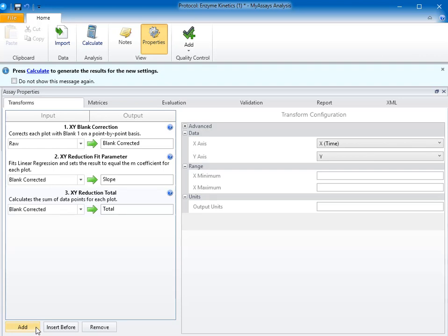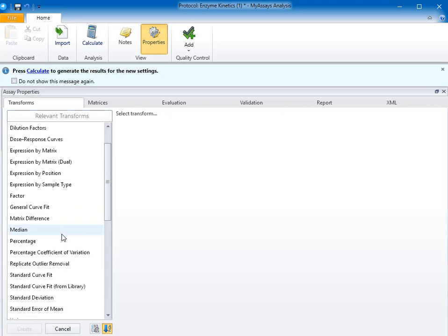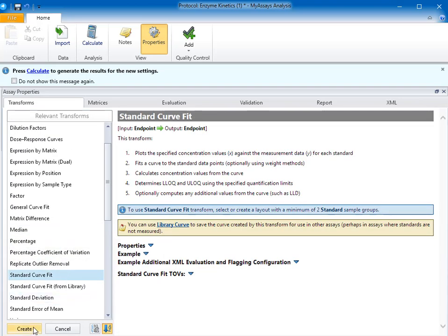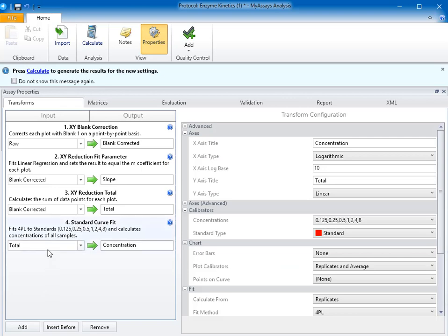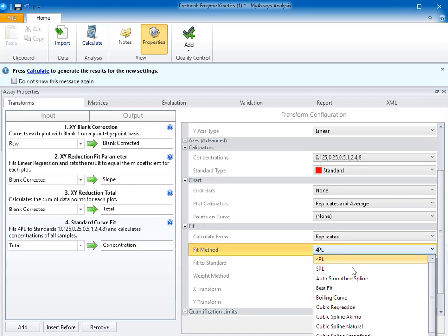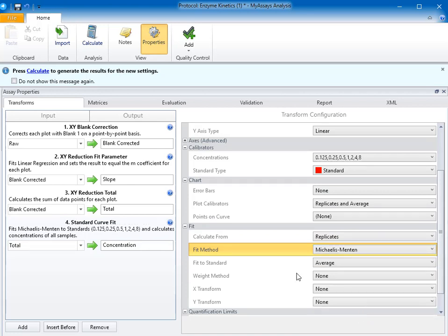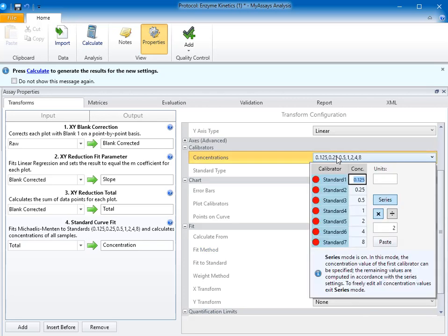Finally, I'll add the standard curve fit transform. I'd like to use the total matrix we just created using the XY reduction total transform as my input matrix. The easiest way to calculate the Km and Vmax is to use a Michaelis-Menton curve fit. I'll set the fit method to Michaelis-Menton and add the standard concentrations that correspond to my assay. In this case, I'll use the series mode, setting the first standard to 1 and the series to multiply by 2.